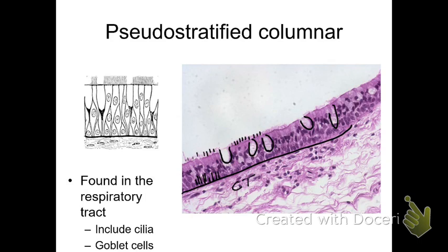So that's what we have here in the pseudostratified epithelium. You have cilia and goblet cells. Now, if we look at this cartoon representation, you can see why these cells are called goblet cells. Look at what the artist has done, right? It's almost like a little wine glass that you can see here, right? And those goblet cells are the ones producing the mucus. So here's another goblet cell here. So it's kind of nice to see it in this medical illustration of these cells.